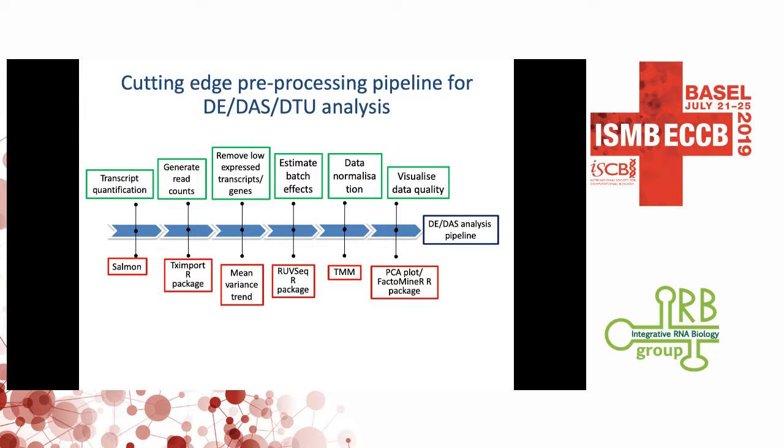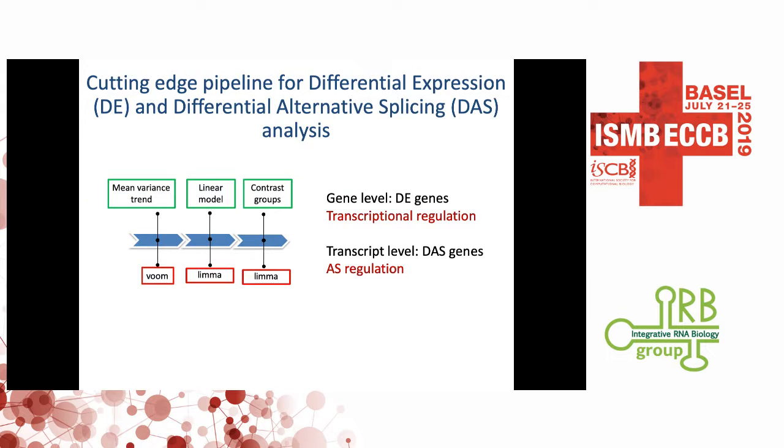So I'll just briefly tell you what's behind this 3D RNA-seq. We adopt the best practices, using different PCAs, for example, to examine the data quality, and also data normalization steps, etc. And then we use limma as the engine to do the differential expression.